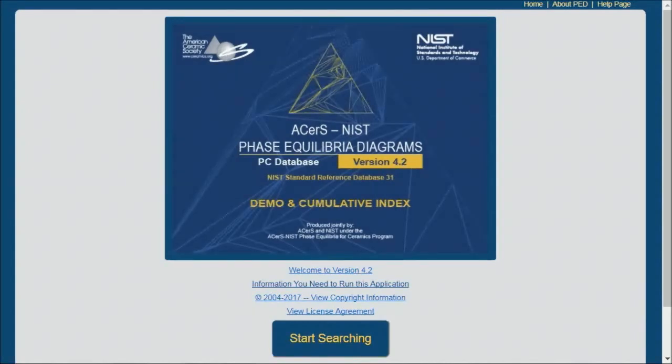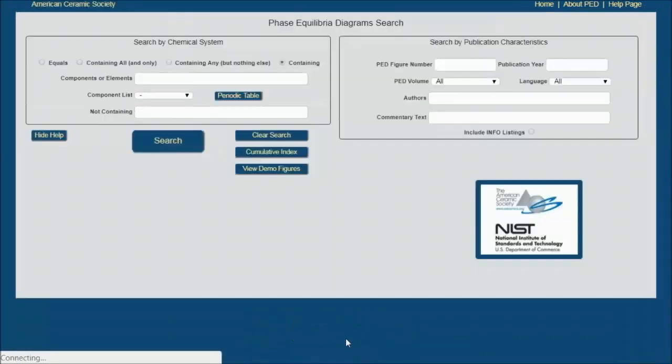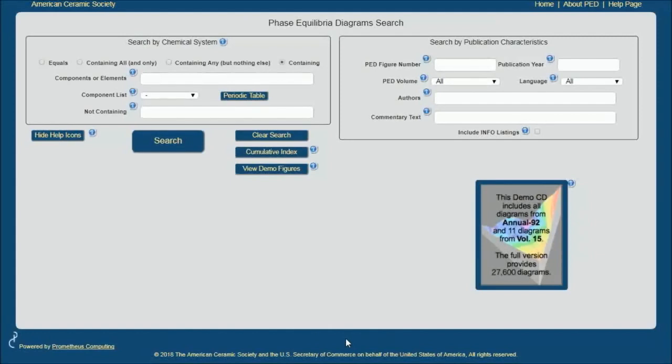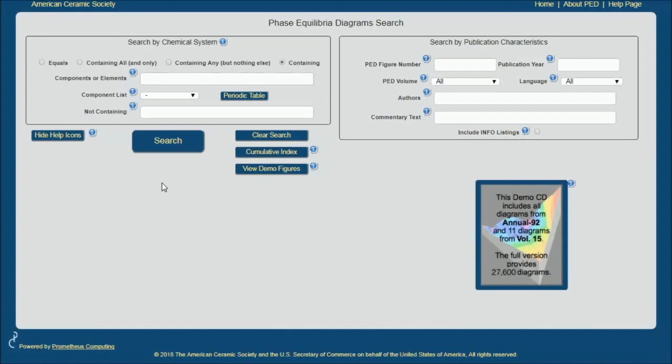Let's get started by clicking on the Start Search button. This is the search screen. You will probably use the functions on the left-hand side of the screen, especially when you first start using this software.